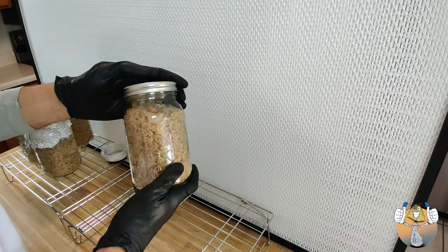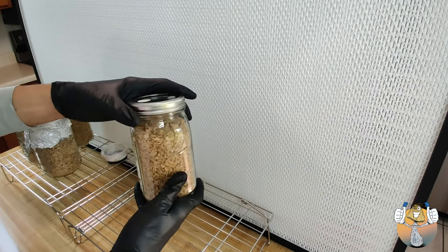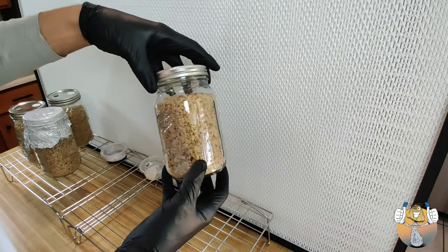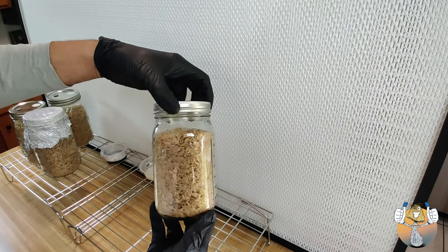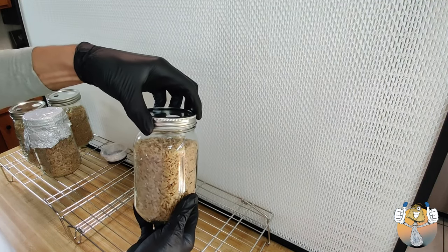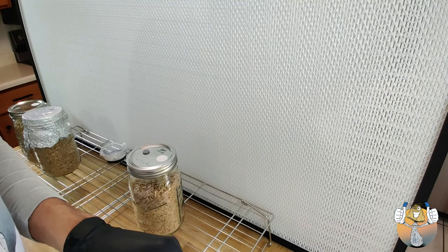And with our jars being almost full to the top, they mix pretty well. And I found out if you just kind of give it a nice little vibrating shake, the agar just falls down to the bottom. So there we have it. We have one jar down and three to go.